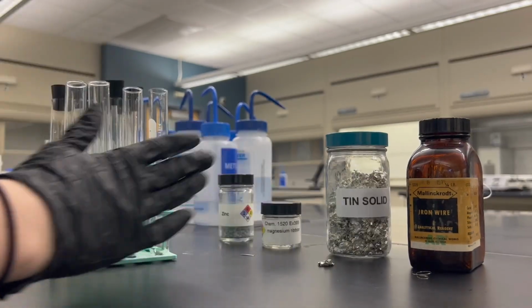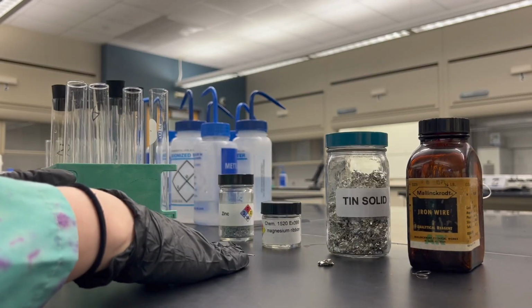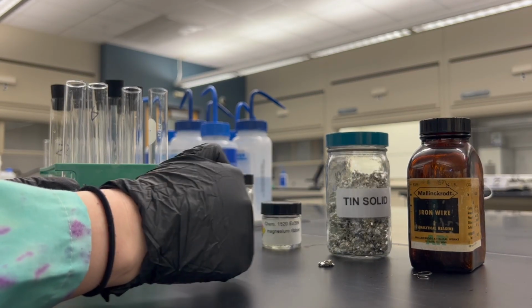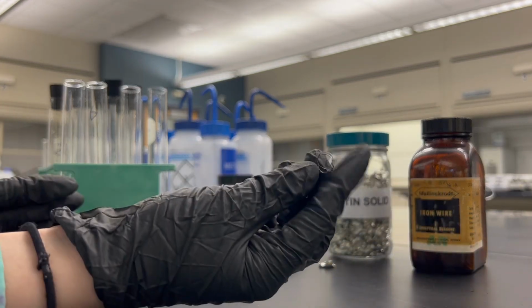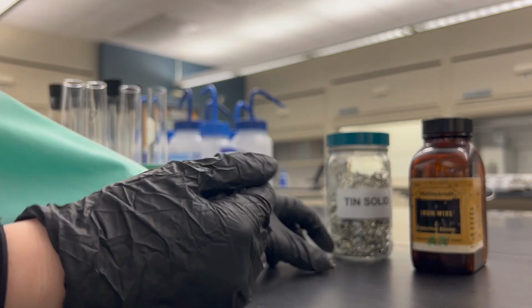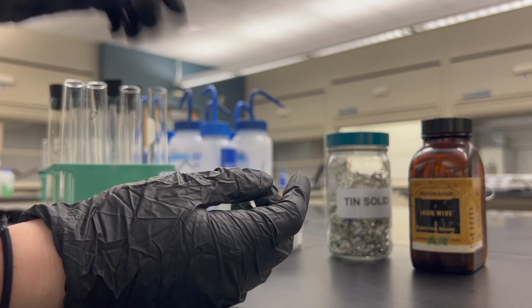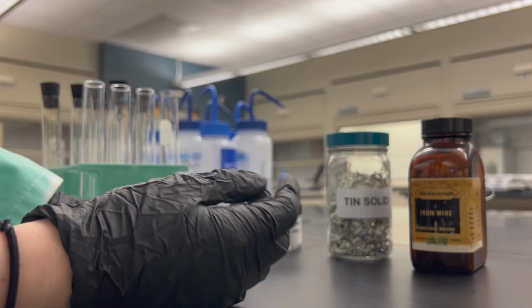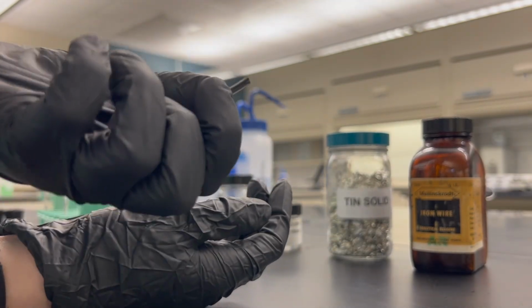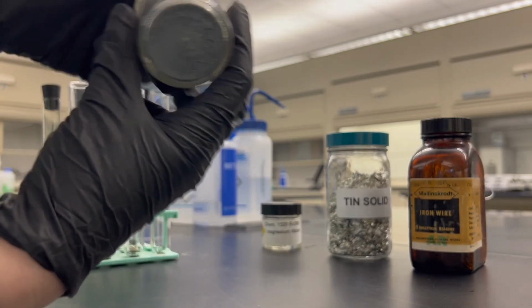Okay, so in each of my 4 test tubes here, I'm going to add a piece of metal, all different types of metal, and then I'm going to add a little bit of water. So first I have some iron, then I have some tin, then I have a piece of magnesium, and then I have some zinc.